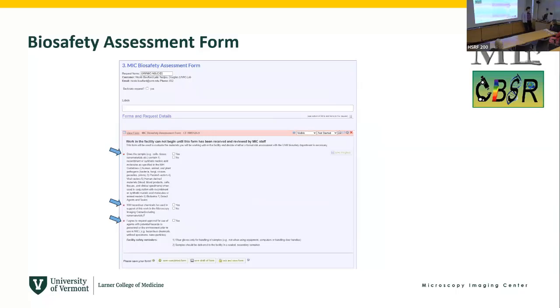Biosafety assessment: we want to know about the samples that you're going to bring into the core facility. Have they been vetted with an IBC protocol? If you answer yes to that first question, you're going to be prompted to enter your IBC protocol number. So please contact your PI to make sure that you know what those numbers are and be able to provide them. And just basic information about how the sample has been fixed and that you agree to take all the proper precautions to deal with the sample that you're bringing into MIC.